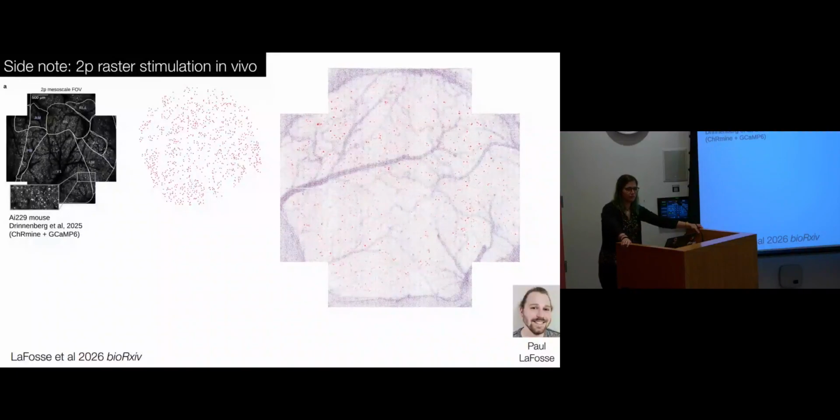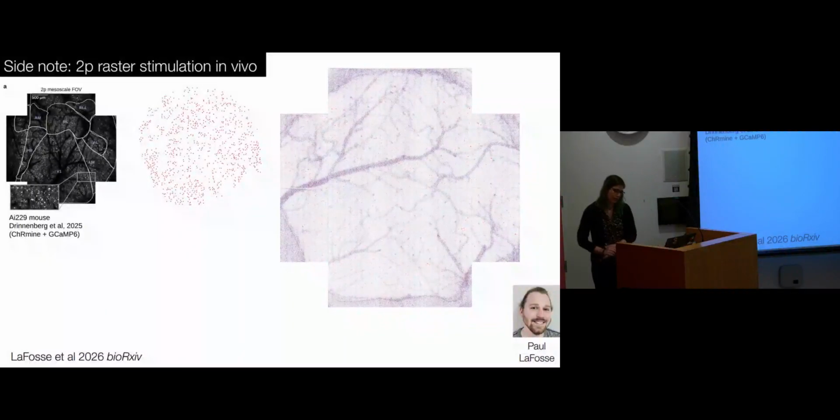How deep can the stimulation go into the brain tissue? It's in the same path as the imaging laser, so it's also raster scanning in the same way. Can you penetrate like 100 microns? We could penetrate deeper. There will be more and more scattering the deeper you go. With two-photon, you are able to go deeper than with one-photon. But we haven't tried deeper than like layer 2/3, around 200 microns. It's a good question.